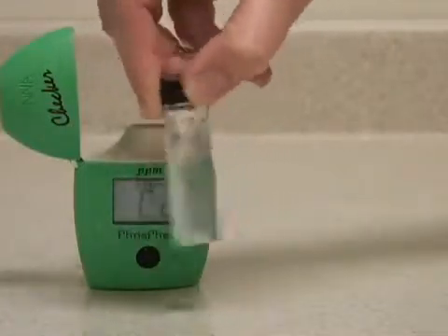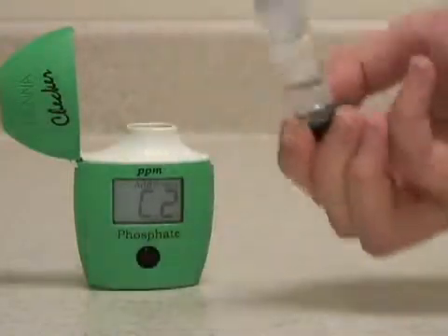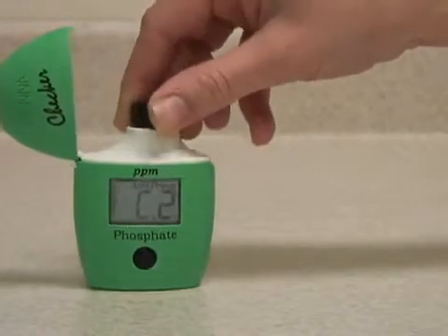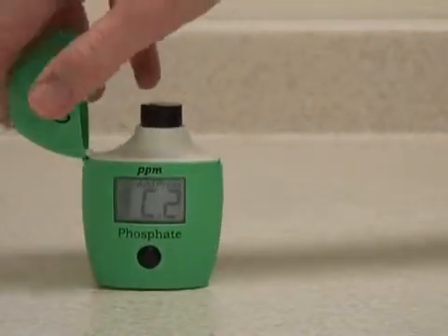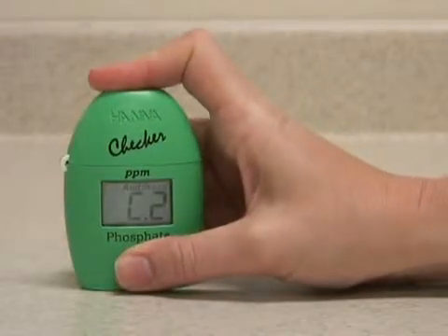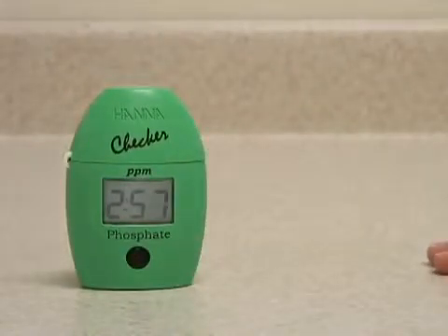The sample begins to turn blue as it reacts with the phosphate in the water. Insert the vial back in the meter, close the lid, and press and hold the button to activate the timer function. The meter will now count down three minutes for the reaction to take place.